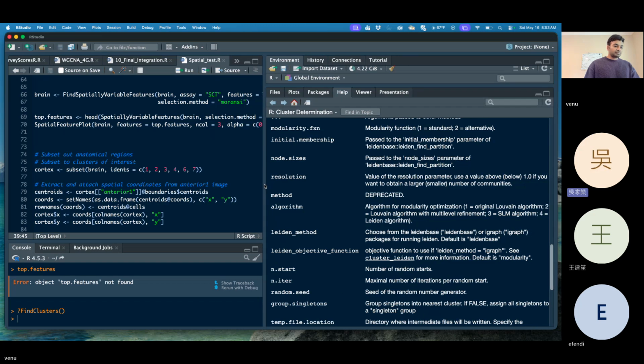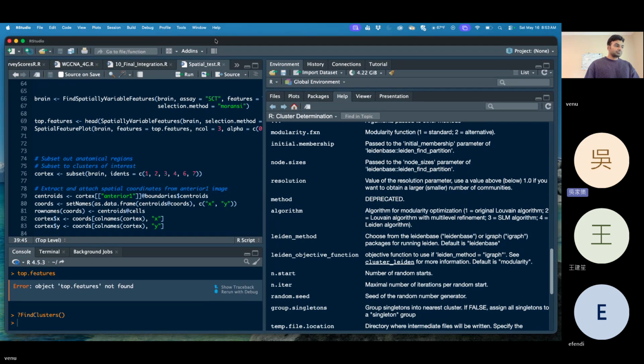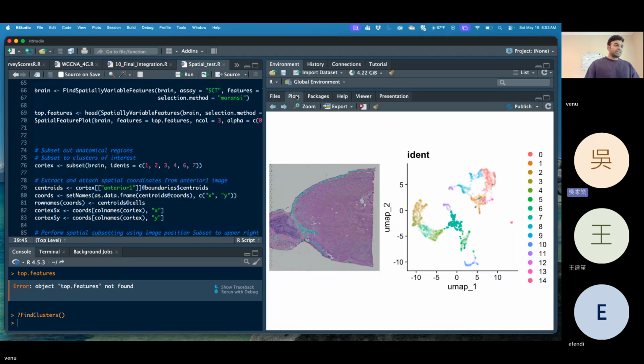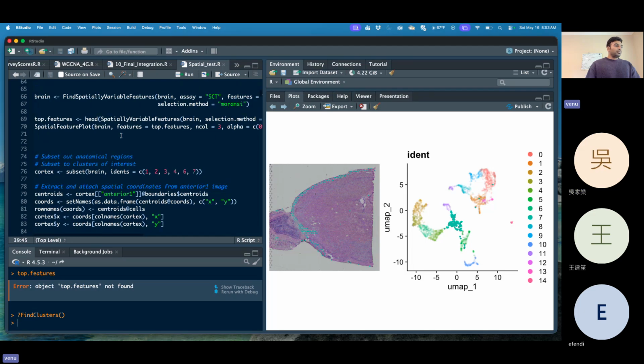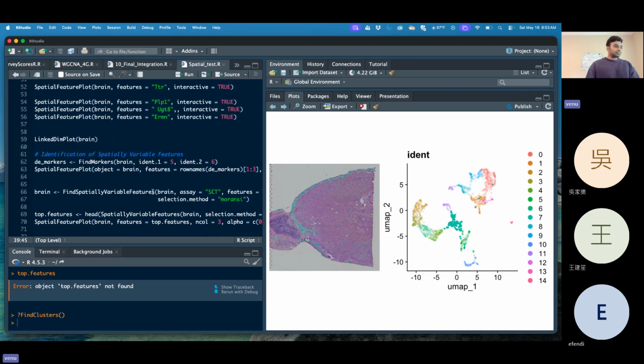Yes. So for the spatial graph-based clustering, what features are used to cluster things that are spatially close? We find spatially variable features. At each spot, we isolate, for example, the top 1,000 genes, and if the top 1,000 genes are aligned with similar expression across spots, they are set up as a group of spots.